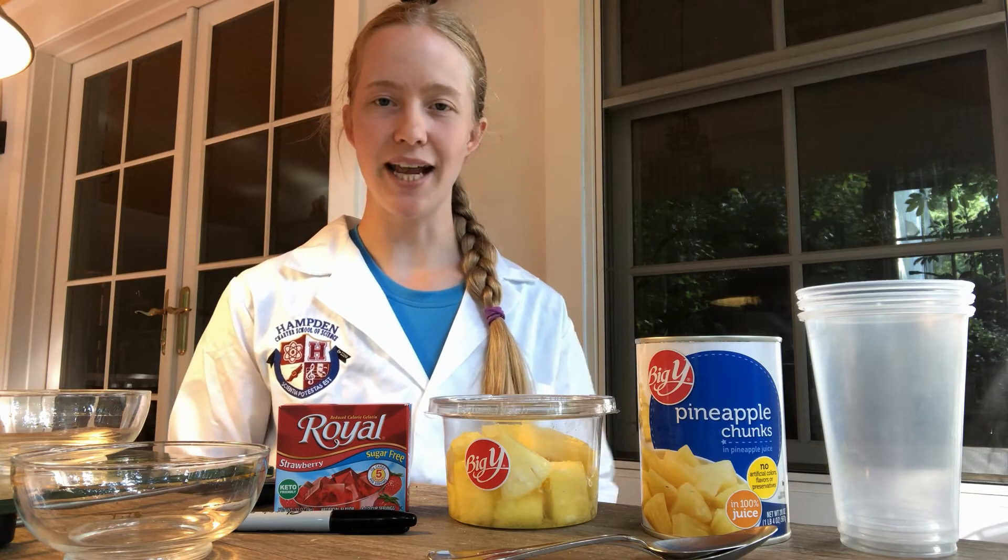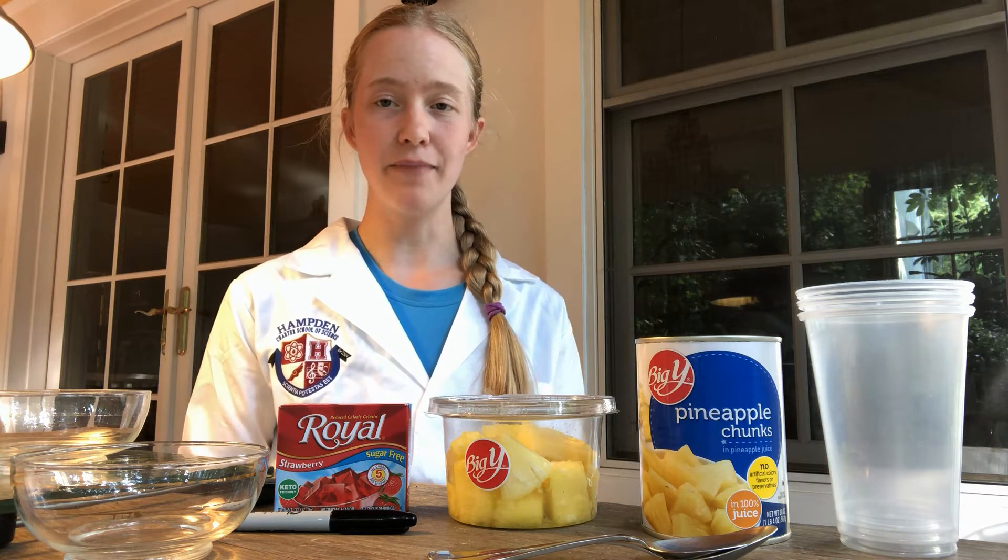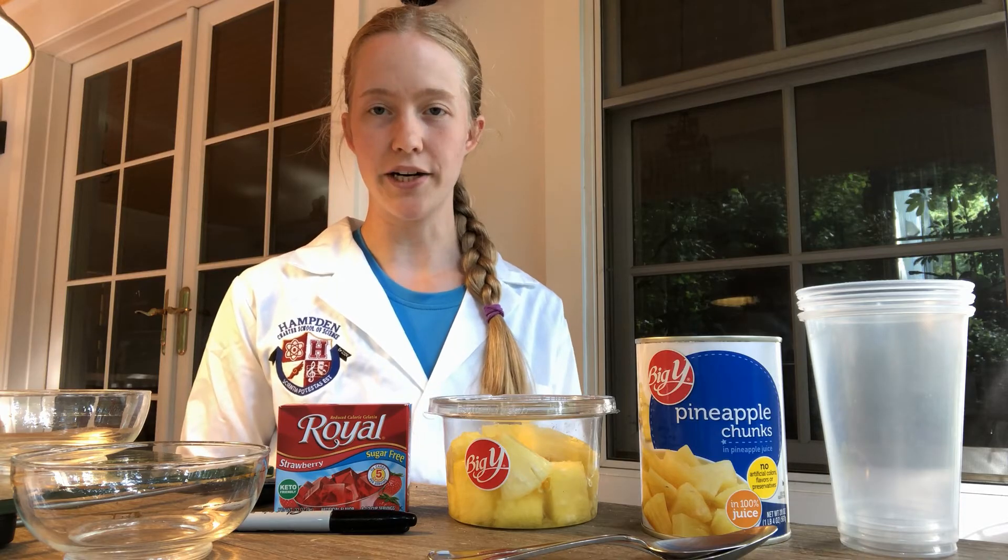This lab is not considered hazardous so I don't need any special safety equipment. However, you can see that I've tied back my hair, I'm not wearing any dangly jewelry or loose clothing, and I am going to be very careful when I'm making the jello because that involves heating up water.